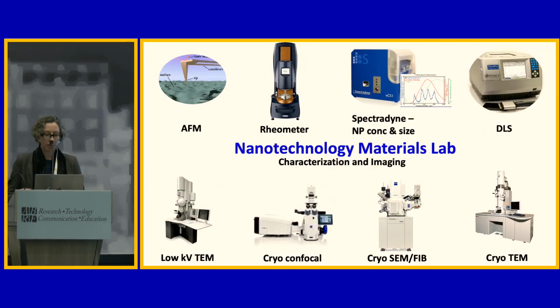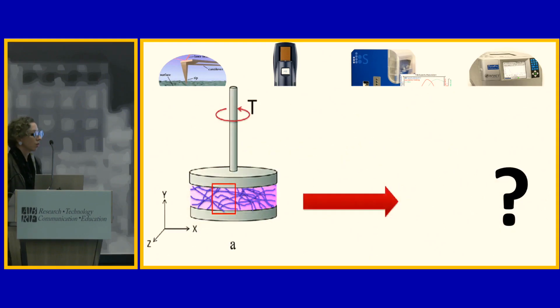Some of our people, after generating their nanoparticles for therapeutic drug release, will then transition into working with hydrogels. They will often introduce these nanomaterials to hydrogels, or maybe they're just working with hydrogels that don't have any nanoparticles present, but they're generating these new materials for tissue engineering, where they want to use a scaffold to grow cells. And so they ask, how stiff is my material? How squishy is my material? As the nanoparticles are releasing drugs, how is this changing the modulus of a sample? And so people will use the rheometer to start looking at these samples in a bulk measurement.